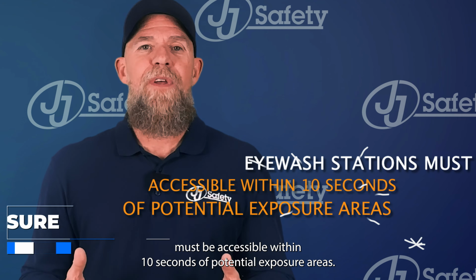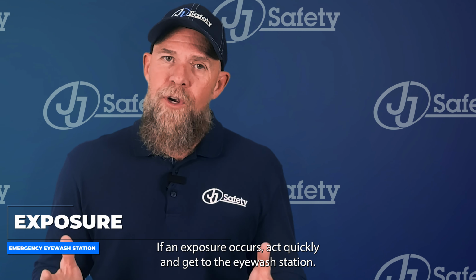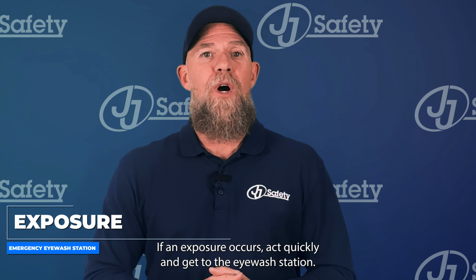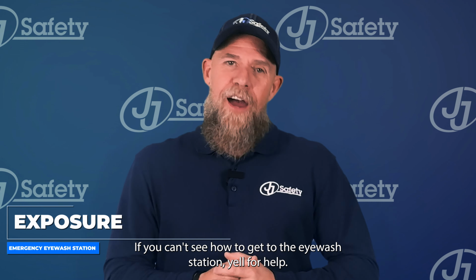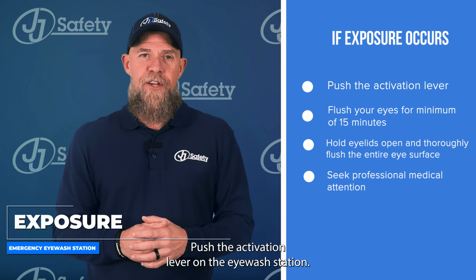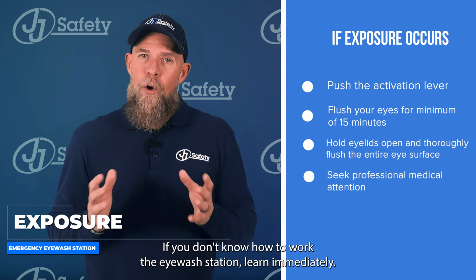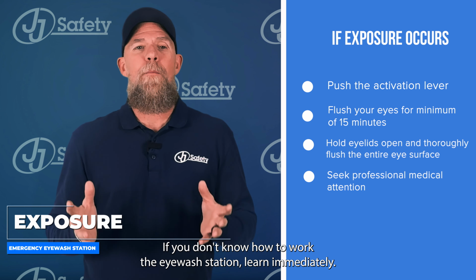Eyewash stations must be accessible within 10 seconds of potential exposure areas. If an exposure occurs, act quickly and get to the eyewash station. If you can't see how to get to the eyewash station, yell for help. Push the activation lever on the eyewash station. The lever should be clearly marked and operable with a single easy motion. If you don't know how to work the eyewash station, learn immediately.